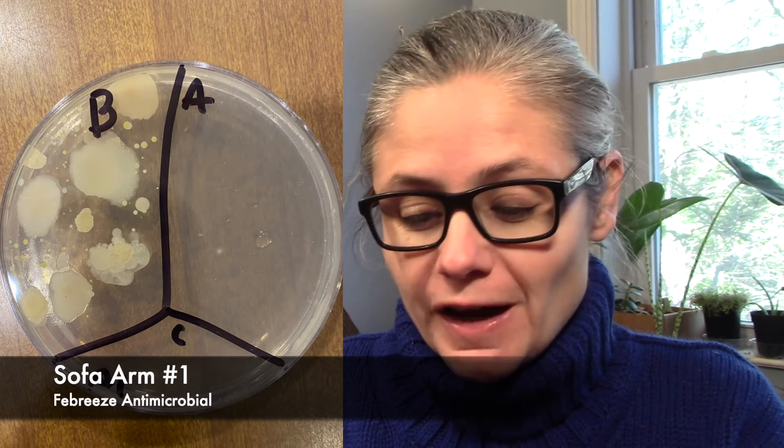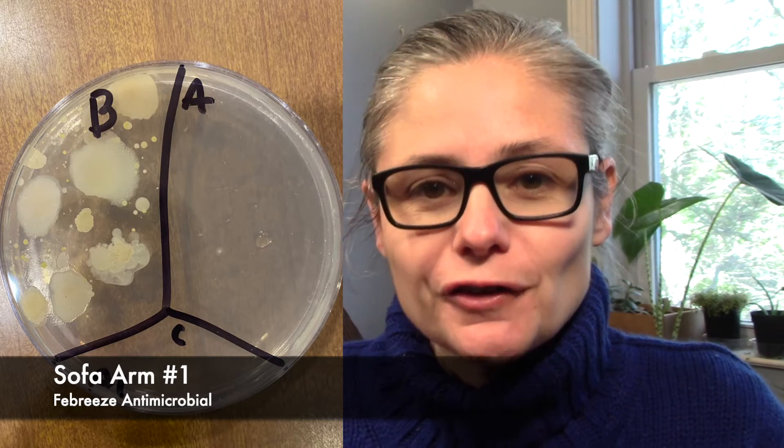Now for some results. Let's start with sample one from the arm of the chair — this is fantastic. The section labeled B for before was the sample before I sprayed with the Febreze antimicrobial spray, and you can see plenty of bacteria there — a great sampling. And in A for after, we have one tiny little bacterial colony. That's it. The Febreze did an excellent job at removing the bacteria from the arm of my sofa.